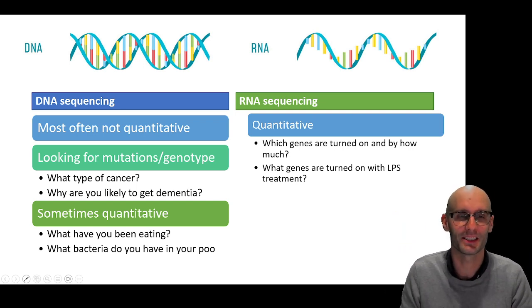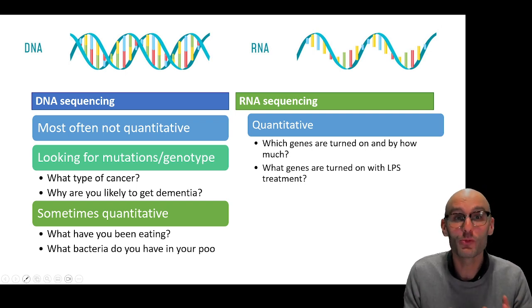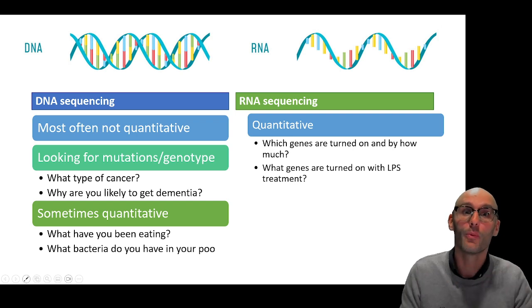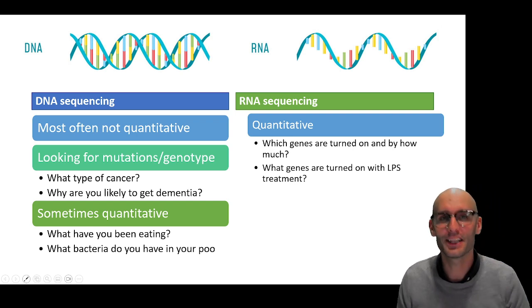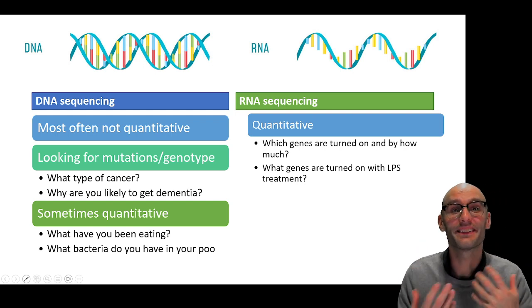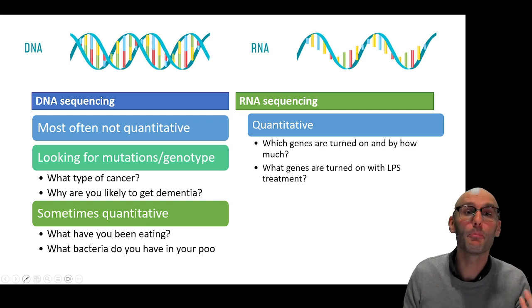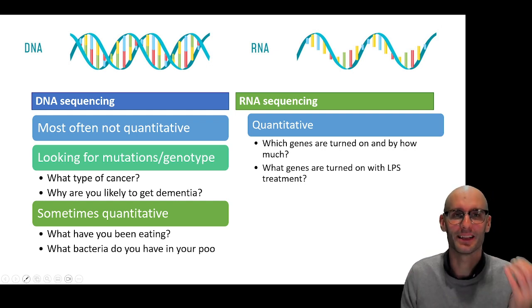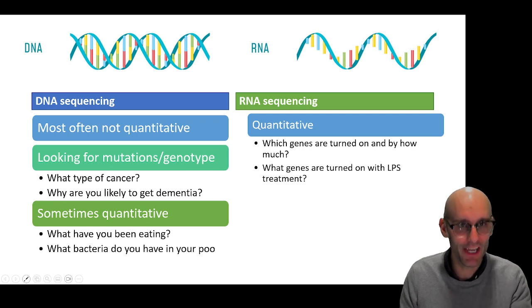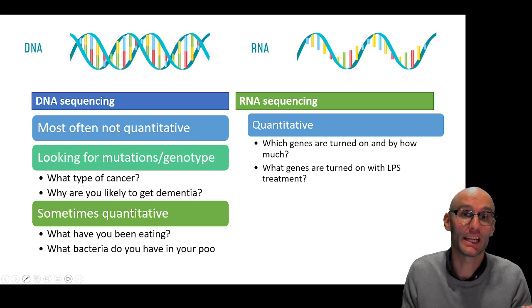That's one of the amazing things about RNA-seq, is we can look at all 20 odd thousand genes simultaneously to see what's happening with your genes. Now, one complication with RNA sequencing is it's hard to know whether the genes are turned up or whether the cells have changed. So for example, if I get a lung biopsy from a healthy human and a lung biopsy from a COVID-19 patient, and I look for an inflammatory gene, maybe a neutrophil gene like MPO, that's a gene that we typically only find in neutrophils, right?